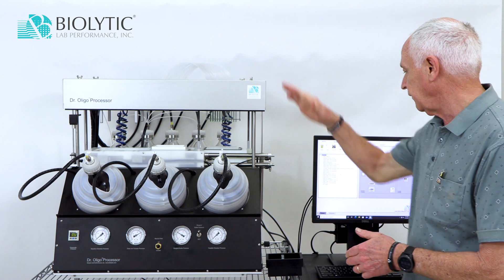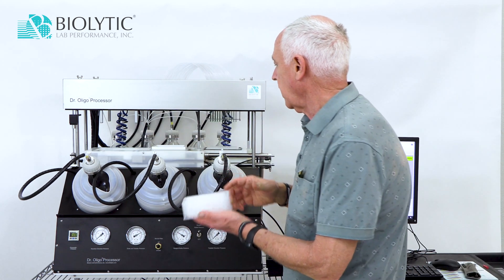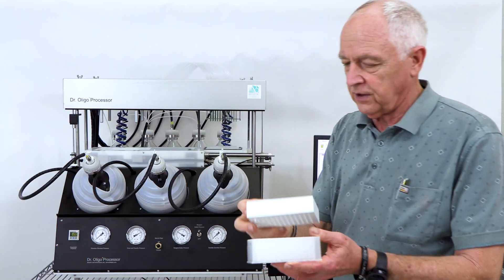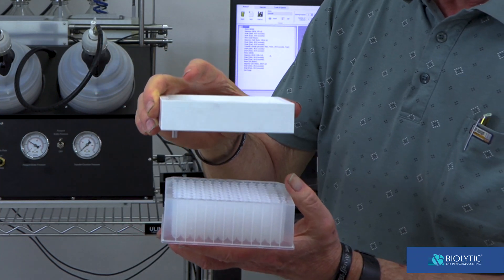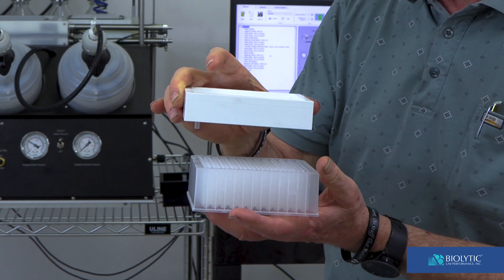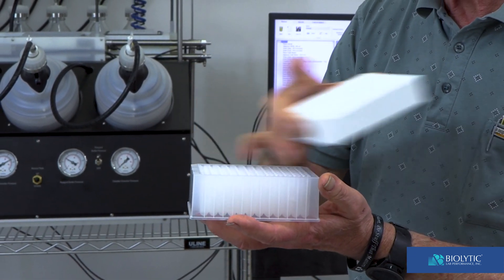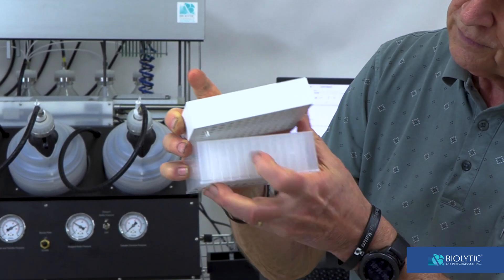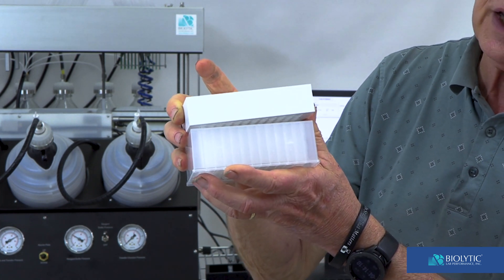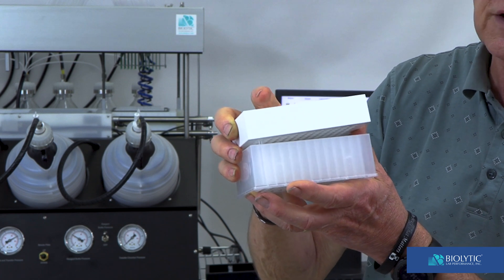There is a collect plate that goes in the bottom here and down into a cavity inside. This is on basically an elevator that can move up — I'll show you outside the machine since it's hard to show inside. Normally this is inside the instrument. We dispense reagent into the top, push it through, and there's a cover so the reagent doesn't go into the collect plate. Then when we want to collect, the cover moves out of the way and this moves up so the column engages with the top of the plate, slightly inside it, so that we do not have any cross-contamination issues. Everything from each column is directed into the well immediately below it and can't go sideways or into another well.